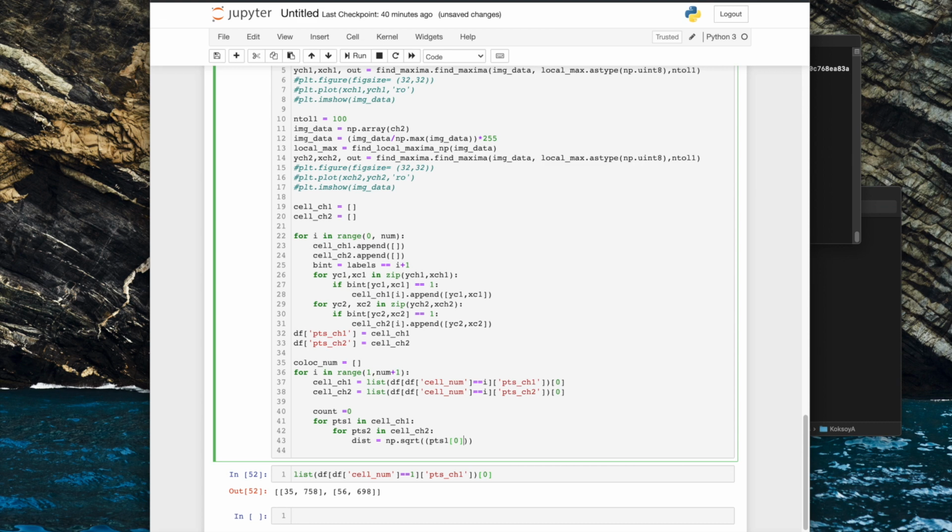So we're going to basically measure the Euclidean distance, or it's like the hypotenuse on a triangle. So you want to compare the difference between the x's and square it, and then compare the distances in the y's and square it so it's positive distance, and then the square root basically puts it back into the space of the original measurements.